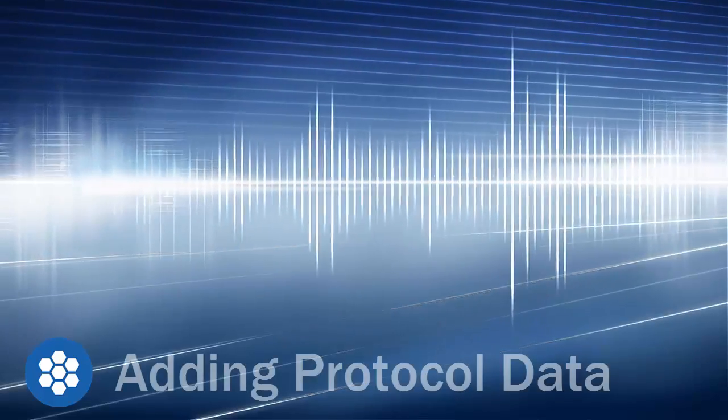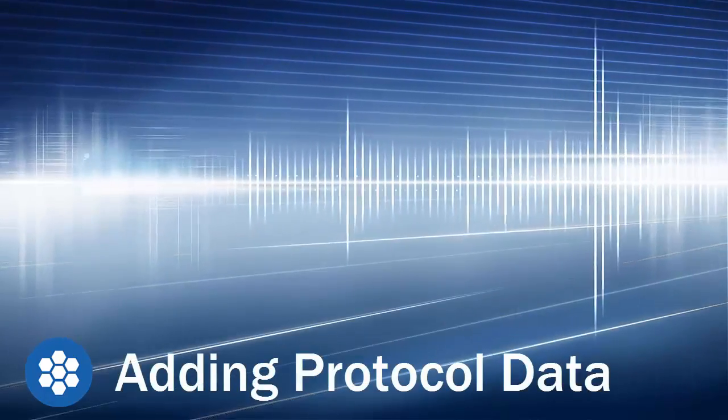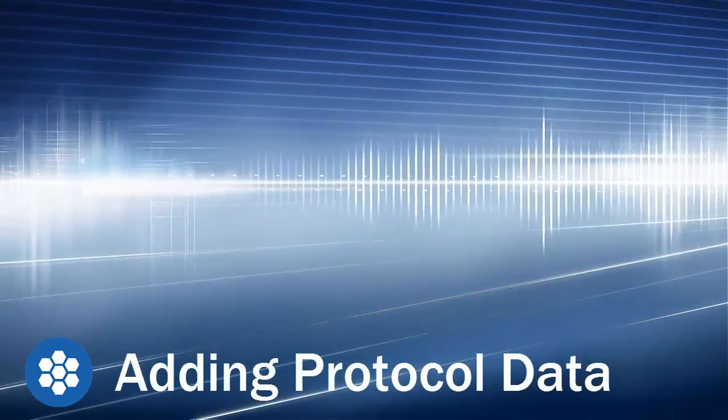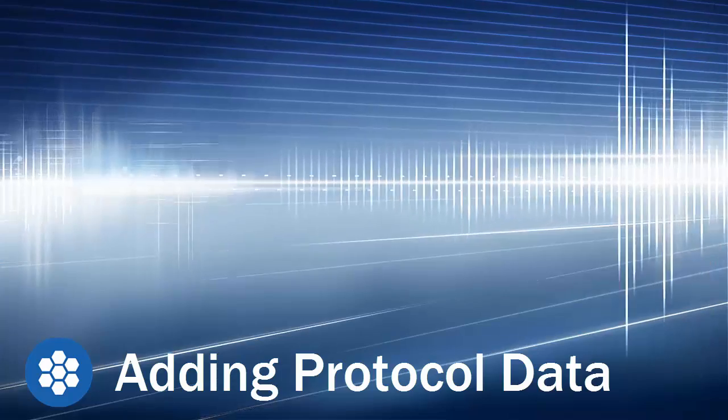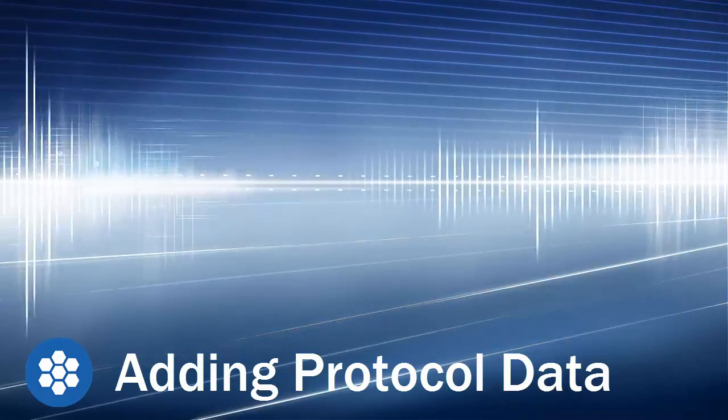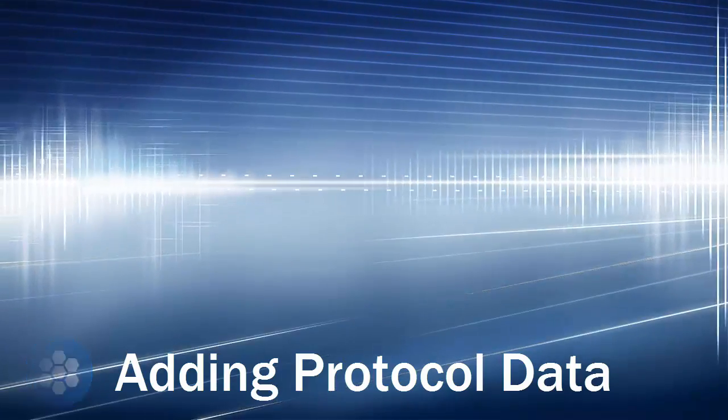Welcome to the Coral Database tutorial on adding protocol data. In this tutorial, we're going to walk you through the steps of adding data to a protocol.